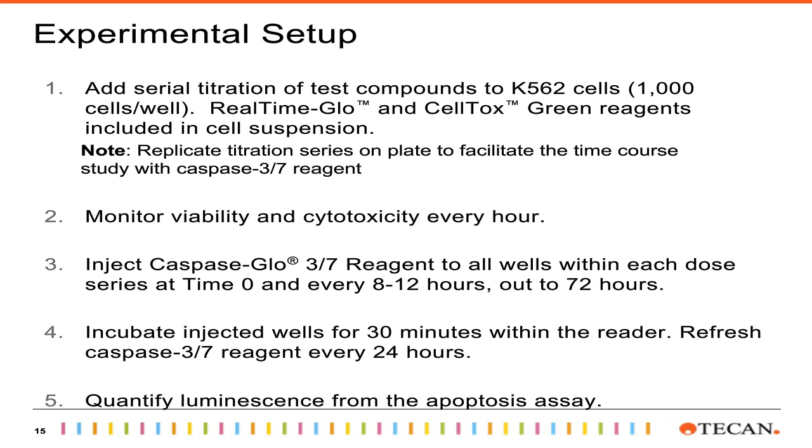So once everything is assembled, we monitor viability and cytotoxicity every hour out to 72 hours. And then at various points in time, we dictated when that reagent was going to be injected by the Spark. So around time zero, or approximately within 30 minutes of compound addition, and then approximately every 8 to 12 hours afterwards out to 72 hours.